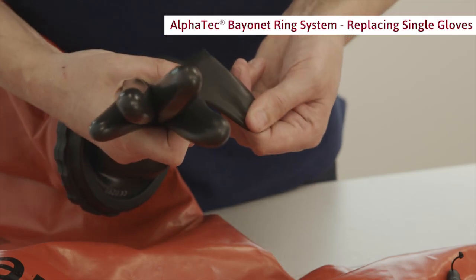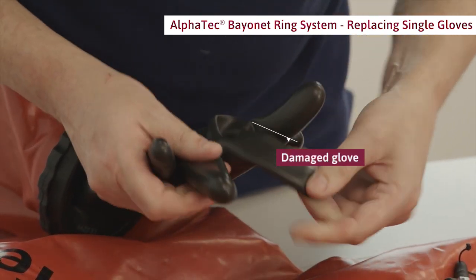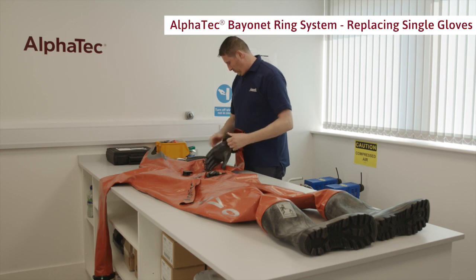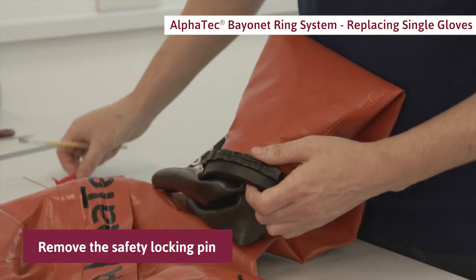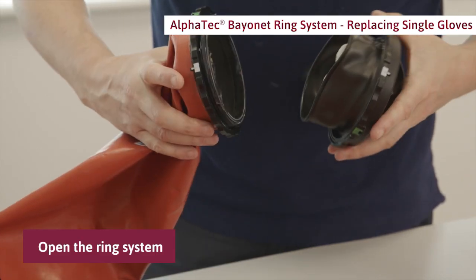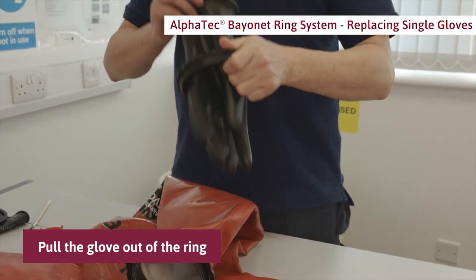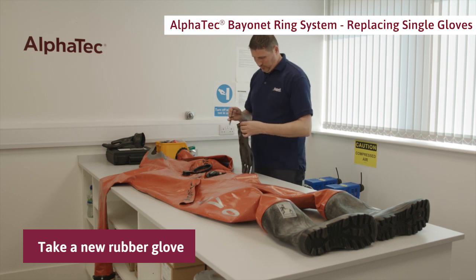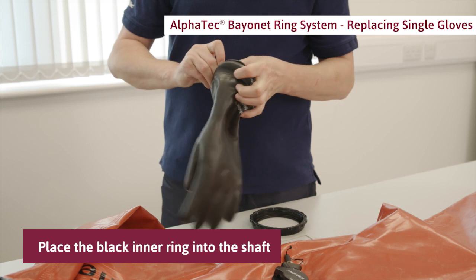Let's take a look at how to replace a single glove fitted in the Alpha Tech bayonet ring system. Check if the rubber gloves are damaged. Remove the safety locking pin, push the rings towards each other and turn to open the ring system. Pull the glove out of the ring.